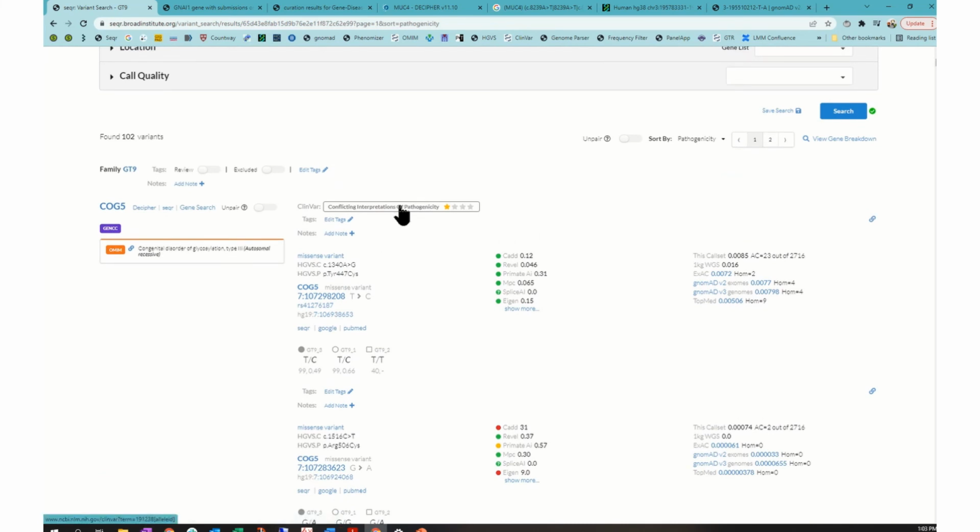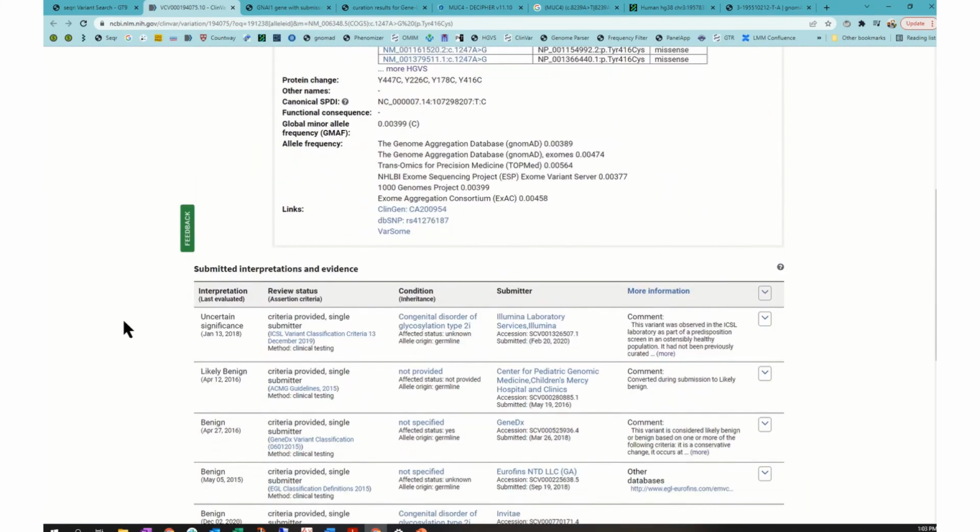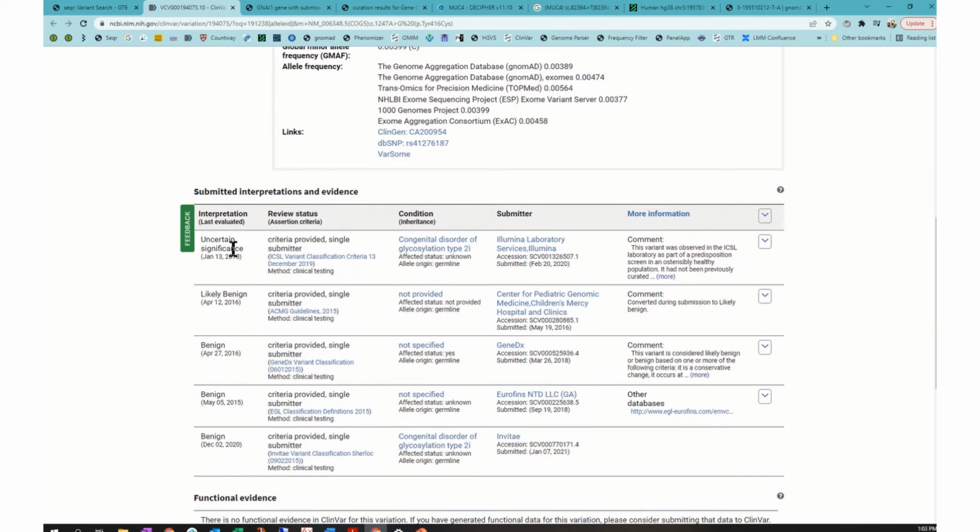I do want to highlight what it looks like when you have a variant that's in ClinVar. You'll see this ClinVar flag at the top here. Also, another flag that we haven't yet seen is this OMIM flag, which shows the gene disease association. It does not mean this particular variant has been associated with a given disease. This is a tag at the gene level. But when either of these are present, you can click directly on the flag to get more information about the gene disease association in OMIM, or to click directly through to the ClinVar entry. That one, as you saw, was a conflicting evidence flag, so you can see there's classifications as uncertain significance by one lab and benign and likely benign by many others in this case.